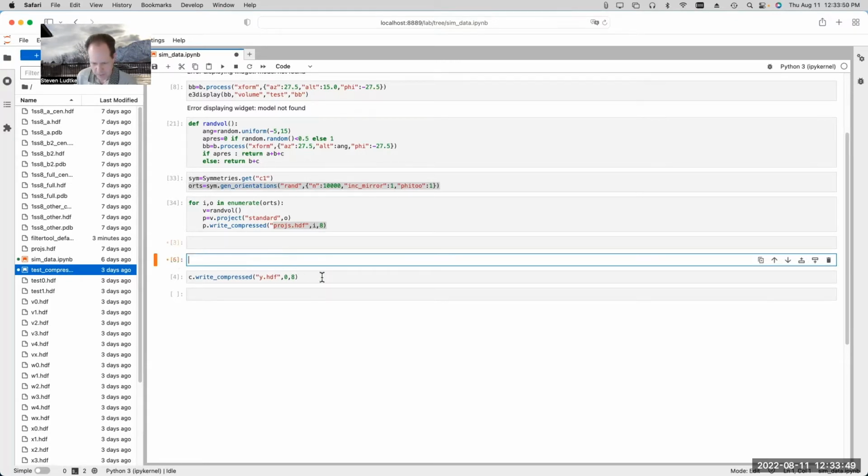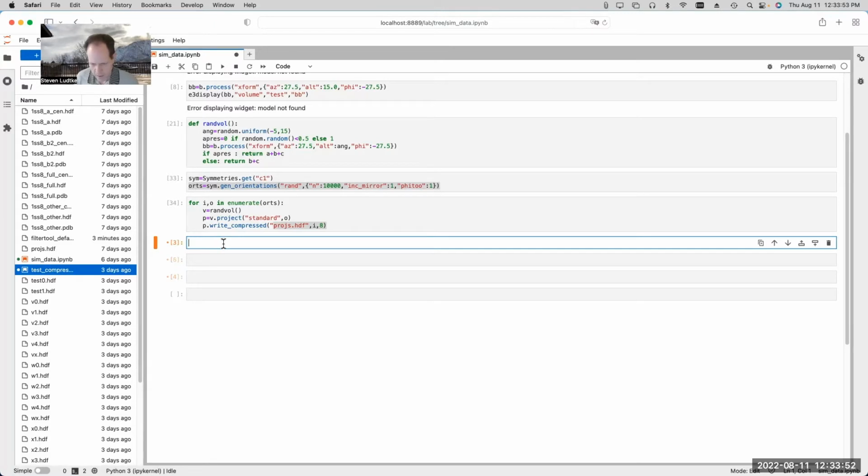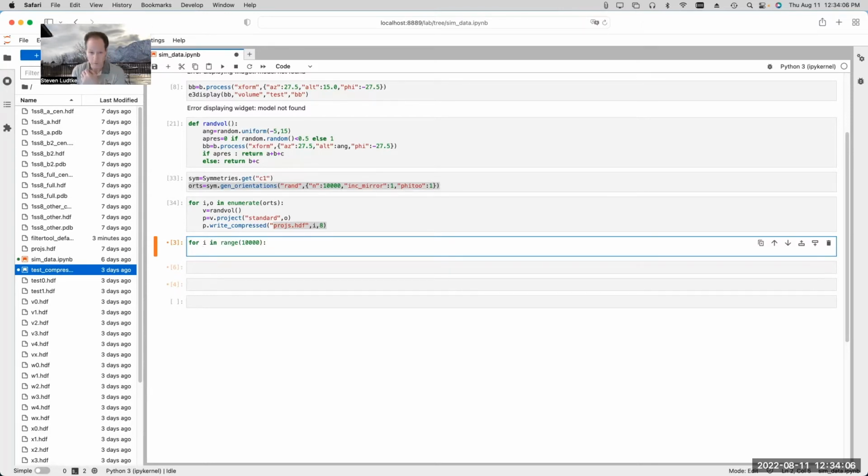We don't need this. We don't need this. So we know there's 10,000 of them, so I'm just going to assume that for I in range 10,000. Now we have to decide how we want to break the defocus up. If we're going to try and do reconstructions or processing on this, we want to sort of simulate the data being in different micrographs and each micrograph having a different starting, or average, defocus associated with it. So it might be that each particle would have a slightly different defocus. If we wanted, we could try and simulate that too.